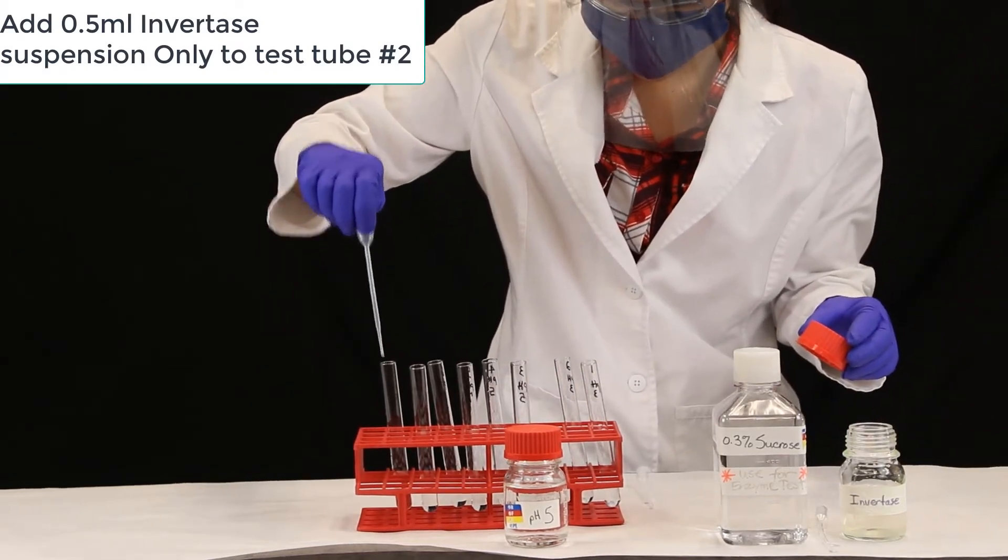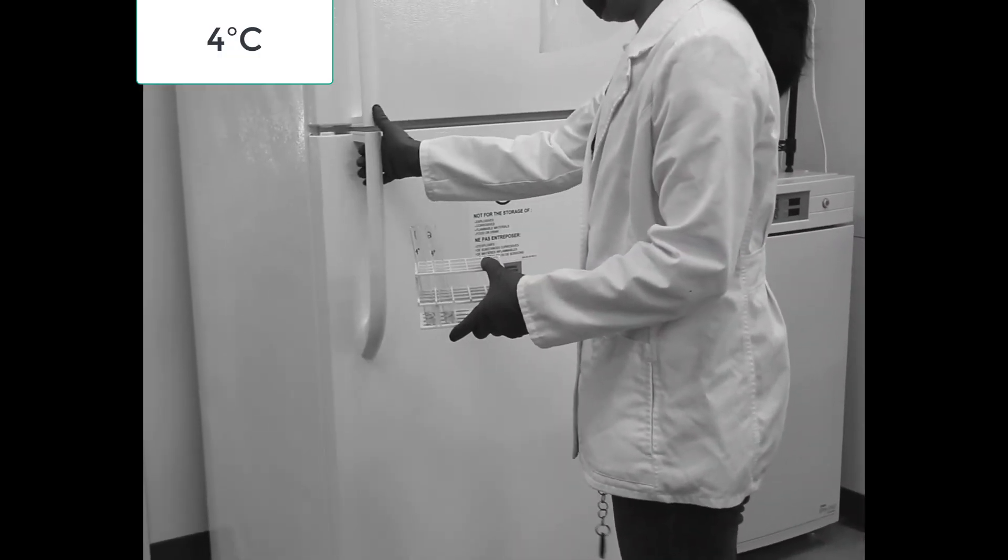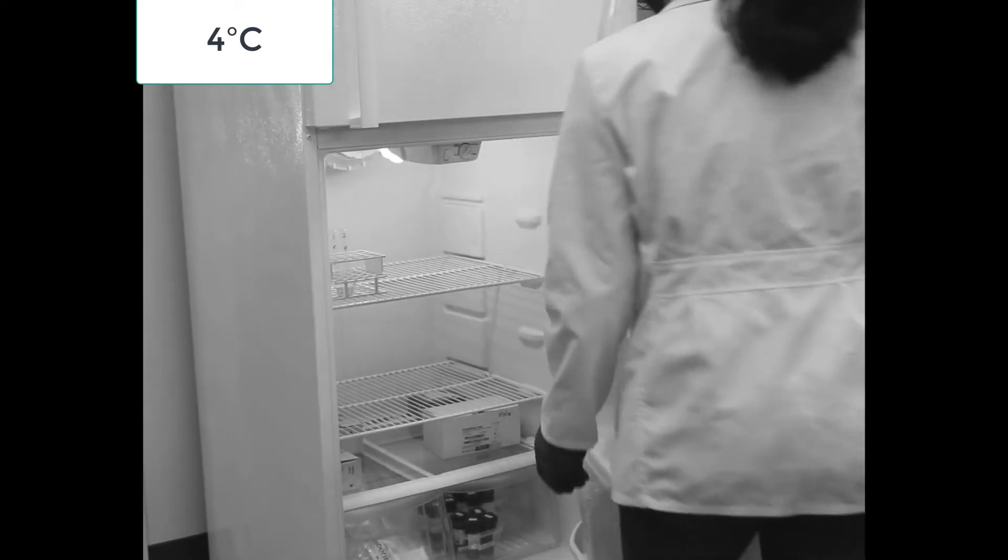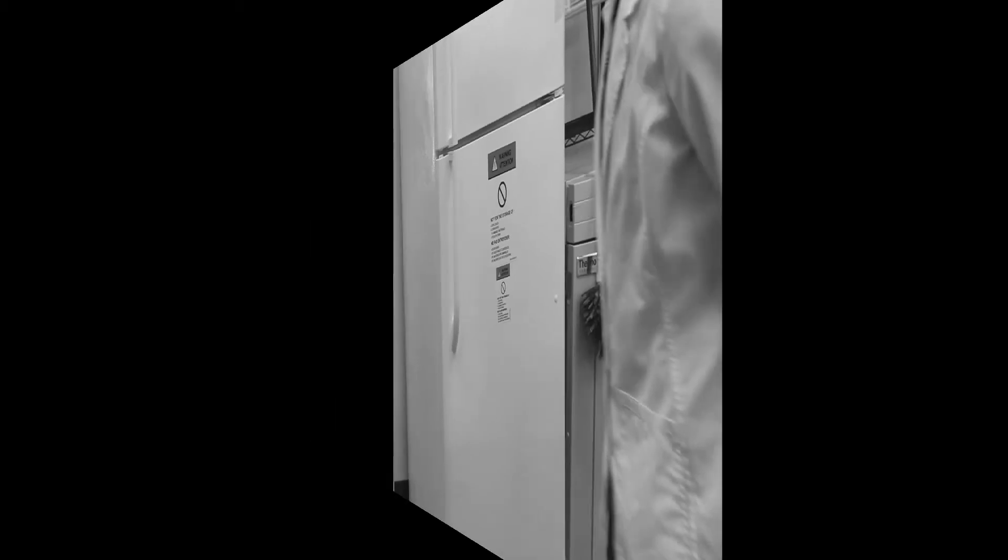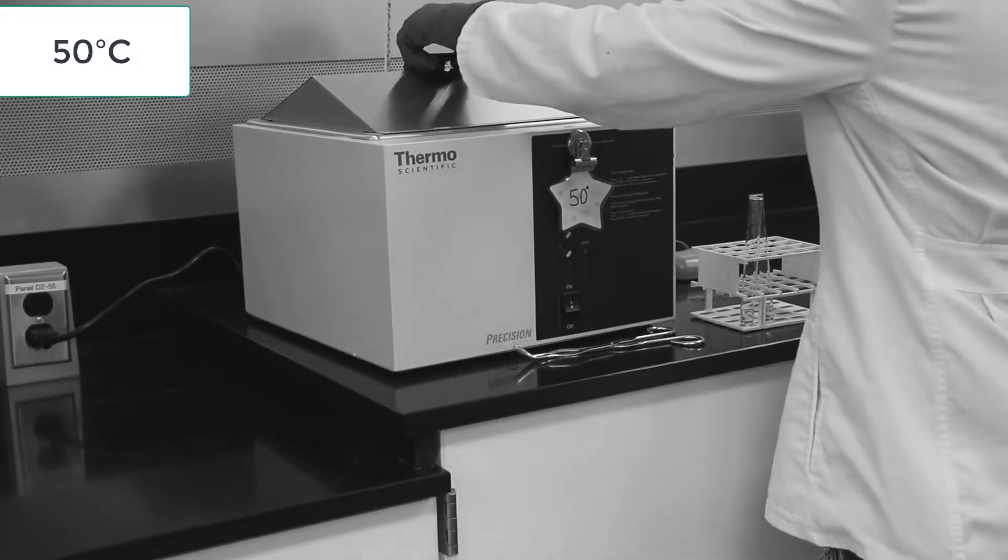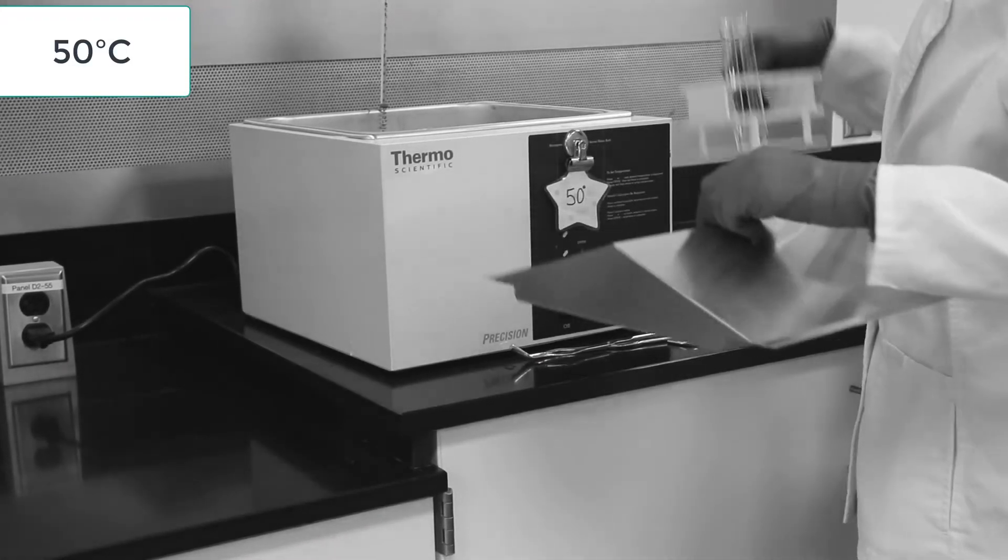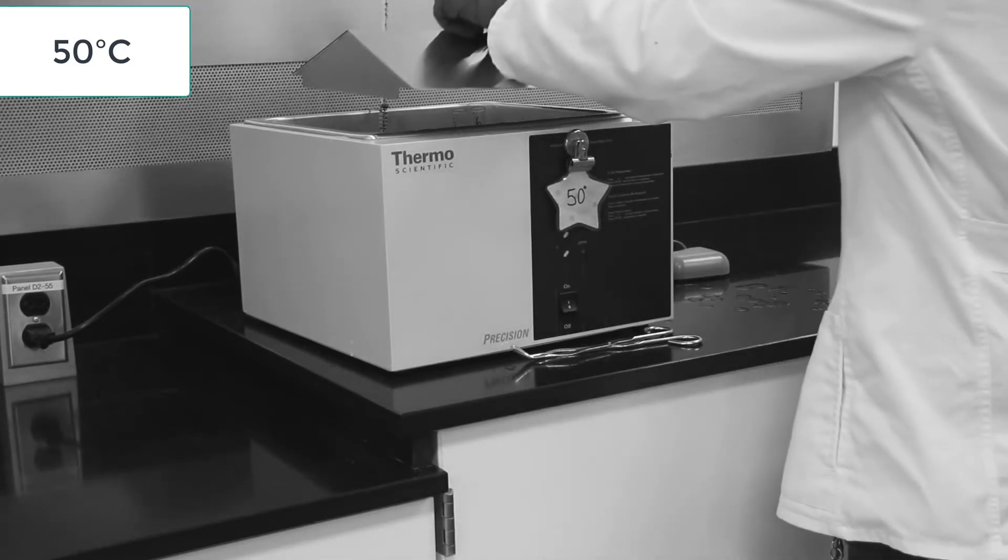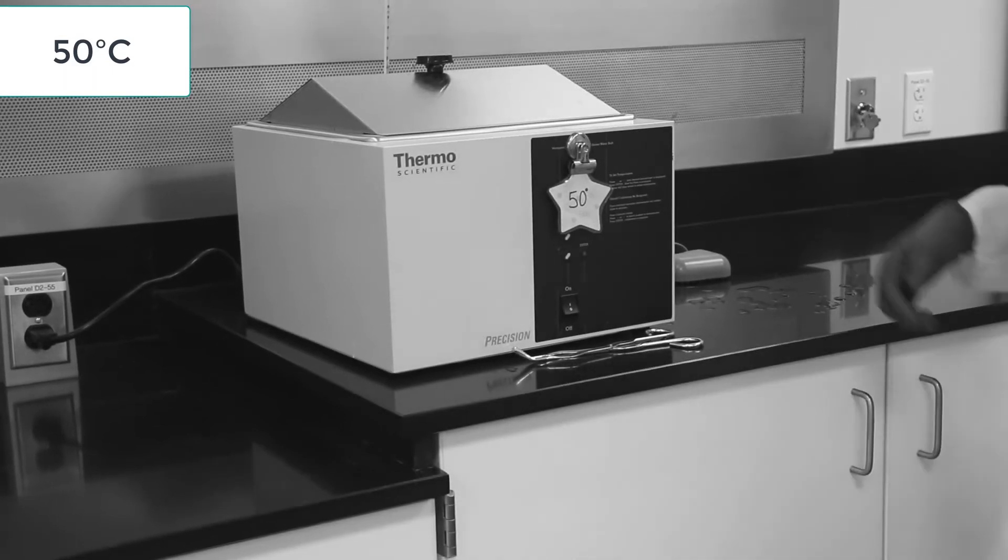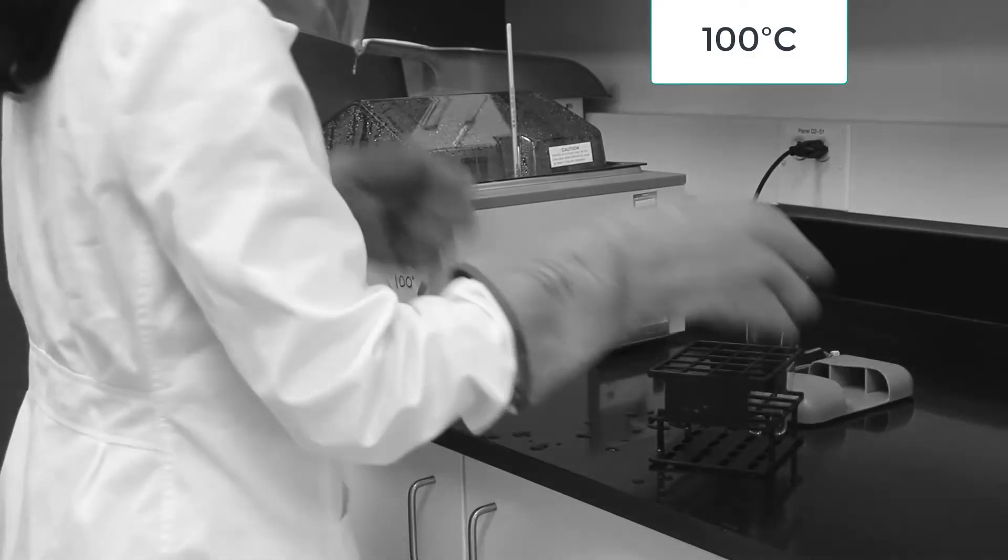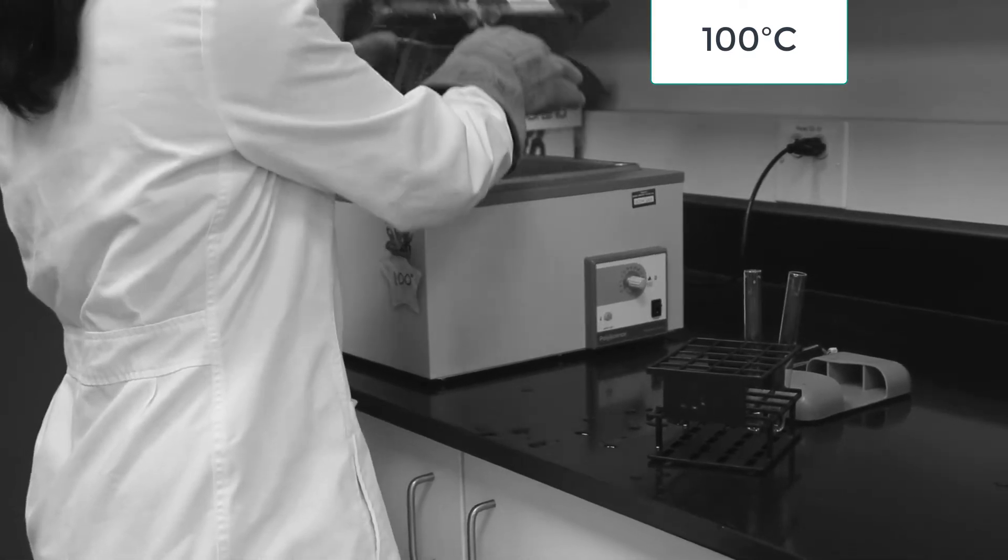We will incubate each group of test tubes at their assigned temperature for 15 minutes. Tubes 1 and 2 go into the refrigerator at 4 degrees centigrade. 3 and 4 will be set on the counter for 20 degrees. 5 and 6 will go into 50 degree water bath. Be careful it's hot. 7 and 8 will go into the 100 degree water bath. Be very careful it's very hot.